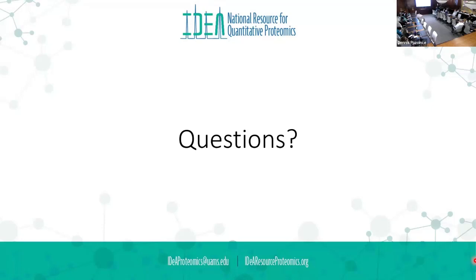But yeah, DIA is tough because of that. Right, so you don't have the abundant signals. You've got the low level signals, and so I think the thought of site localization is almost a joke with the DIA data. It's going to have to be, it's this site because that's the consensus site that everybody's seen from this peptide with a retention time of 38 minutes and mass to charge 720.